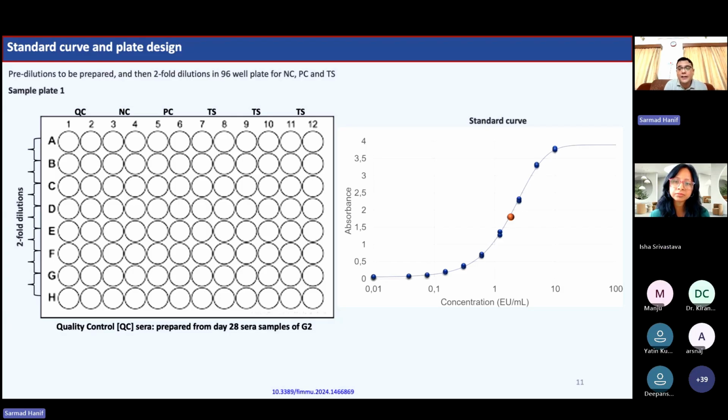If there is a severity or an urgency, you have more and more head count, and time is kind of limited. So you establish the assay with all the checks and balances in the correct manner, and try to establish it as soon as possible. But generally, if everything is in place and you have a reasonable head count in a lab, it takes around 3 to 6 months to develop and then to validate. You also have to validate your assay regularly, whether your assay is giving you the right results or not.